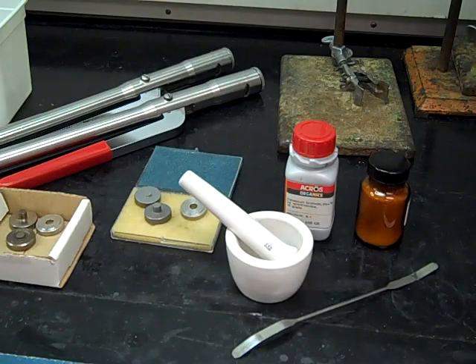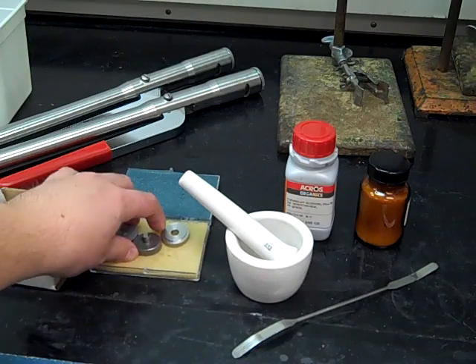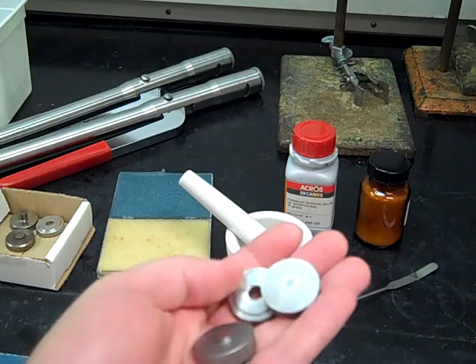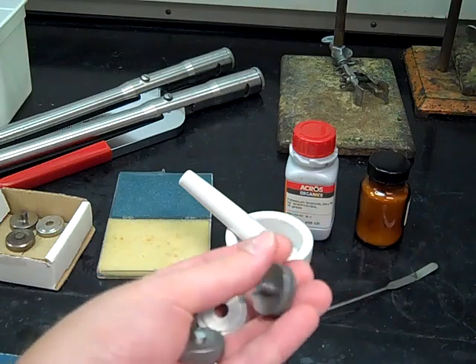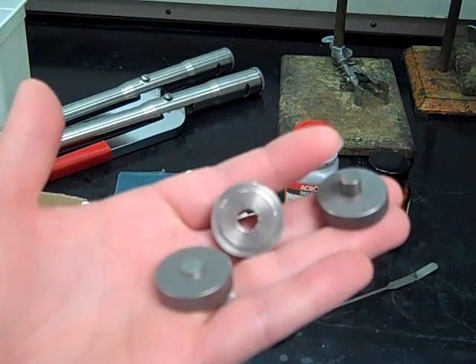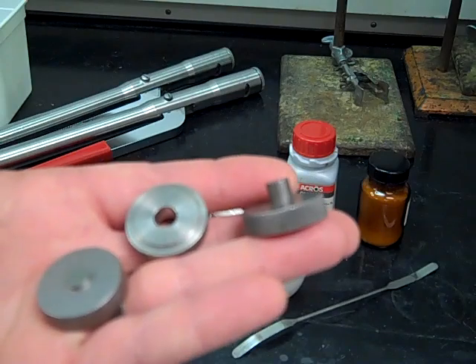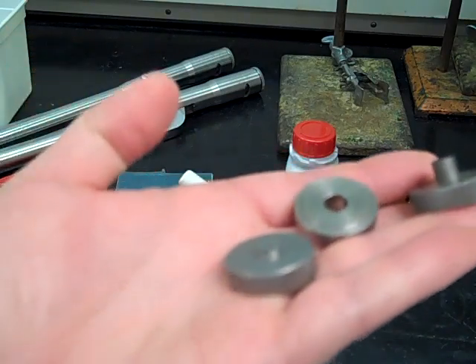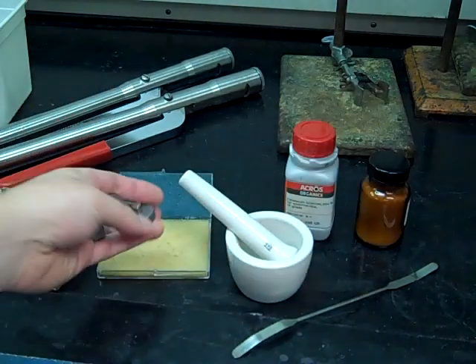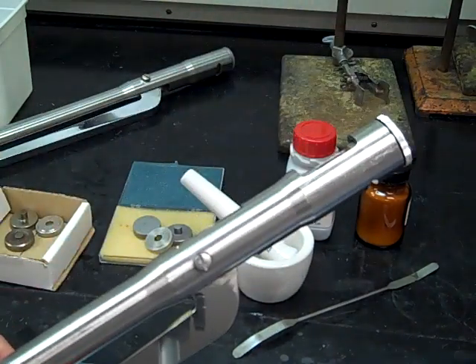Also, on the other side, we're going to be needing a 3-piece IR die set. These 3 pieces are matched together, so if you see 3 together, don't exchange them with another 3. There is a middle donut, with a hole through the center. And then there's a bolt that has a larger stem, and then a bolt with a much smaller stem. So you'll need all 3 of those pieces, as well as the pellet press itself.